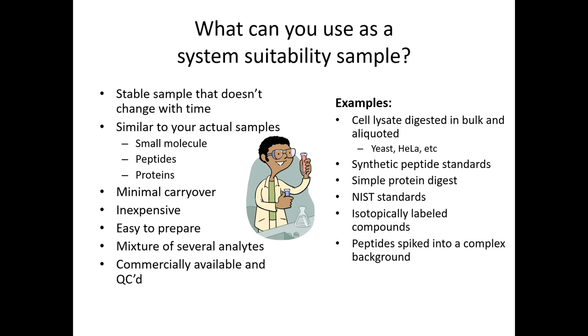So the HeLa lysate digest, in my experience, is very stable. I've used it for up to a month in the autosampler without really having any big deal.